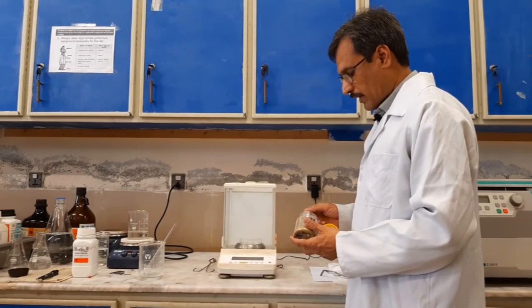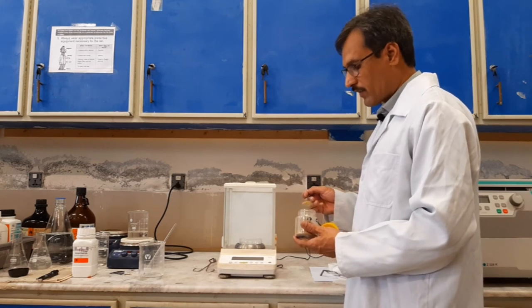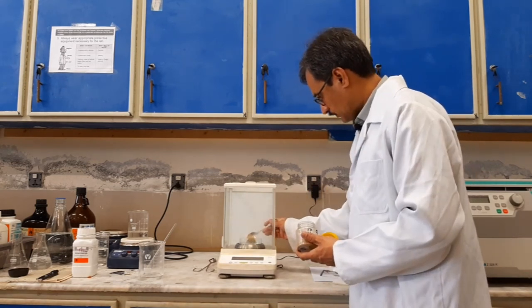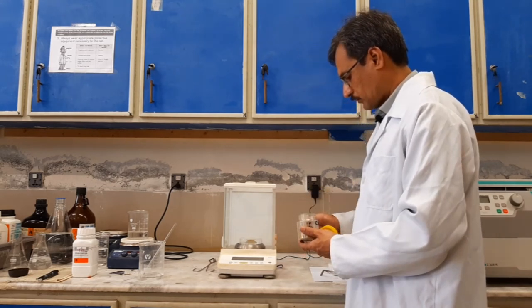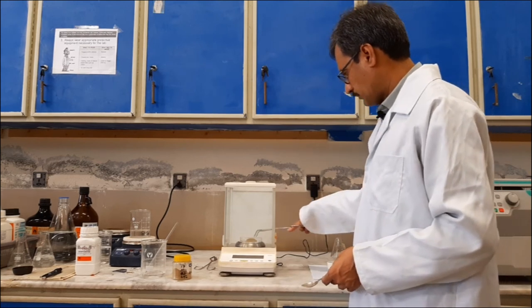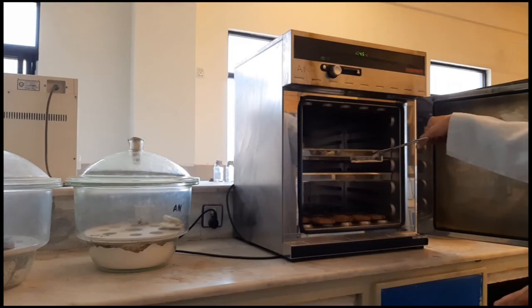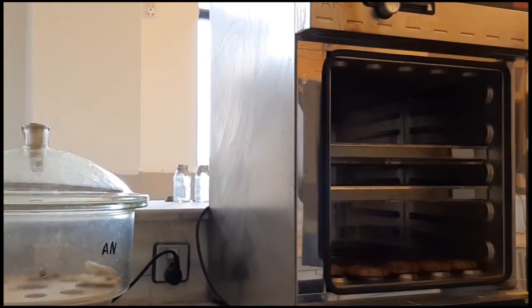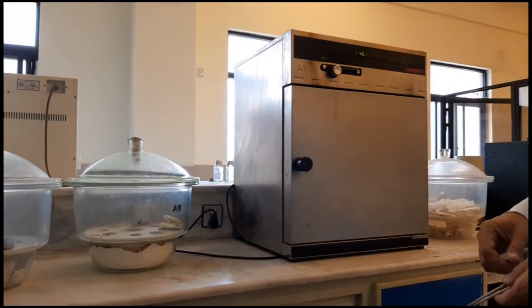Now weigh at least two to five grams of sample. Record the weight. Now place this petri dish in an oven at 105 degrees Celsius for up to 20 hours.